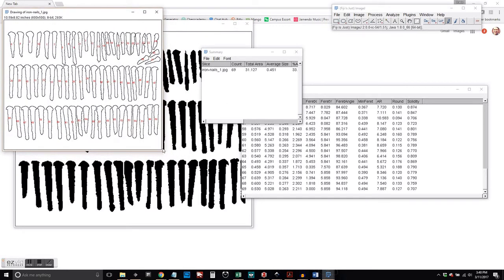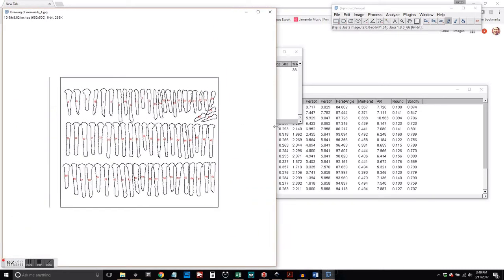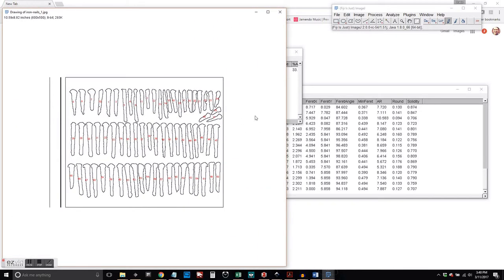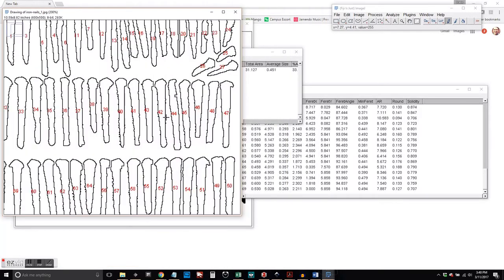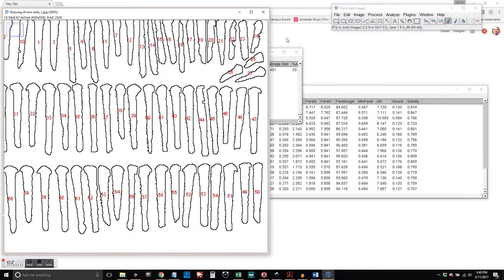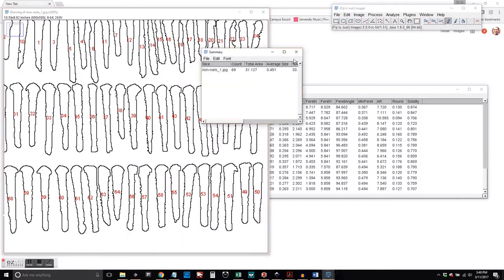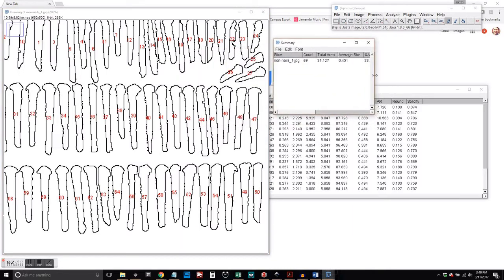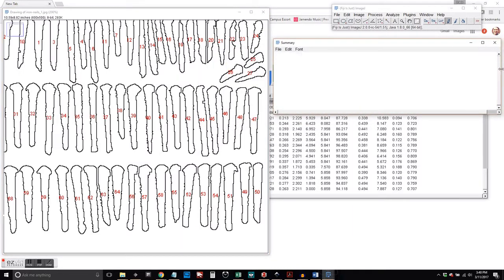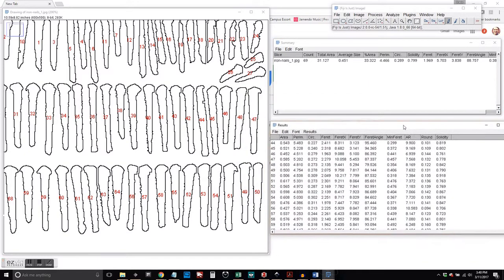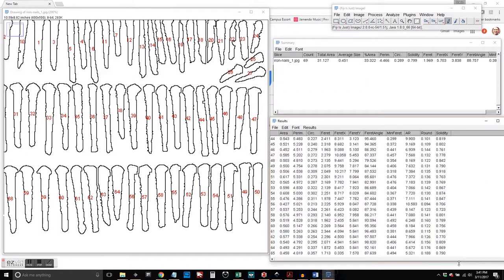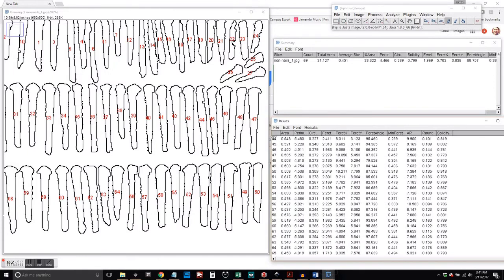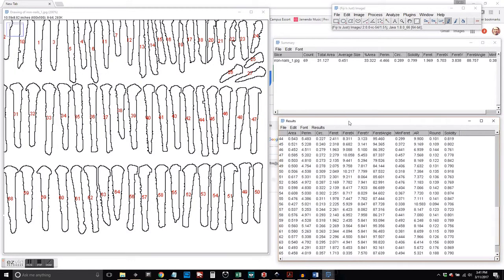We've got our nails counted. And we've got a total of 69. You can see each object has been numbered by ImageJ so that we can make sure that we have as many objects in the image as we think we should. This is important so that we can check our data.